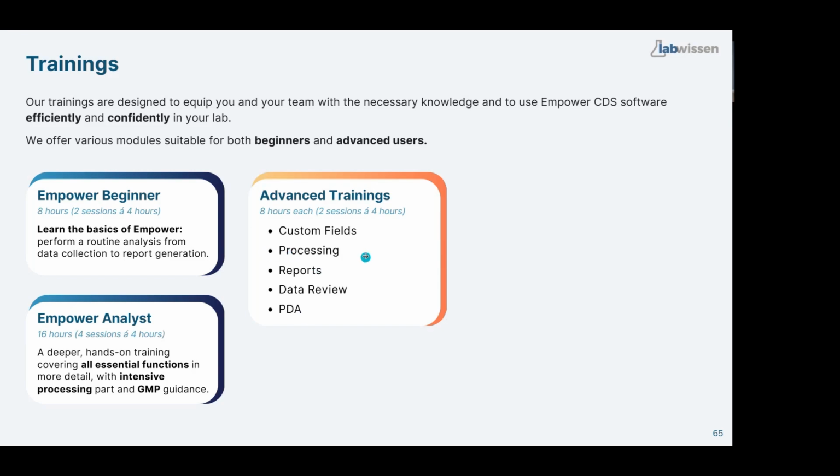Then there is also a processing training where we go through all steps in the processing method, discussing how we set the impurity tab, how we set the suitability tab, how we set integration parameters, and what the difference is between ApexTrack and the traditional algorithm. So all these advanced processing things. Reports is quite a simple training, but still takes one day: how to create report methods in Empower, because the Report Publisher tool is not really user friendly. So it takes one day to learn it.